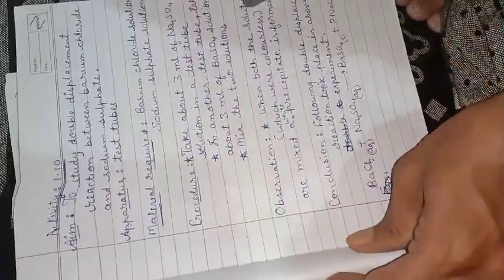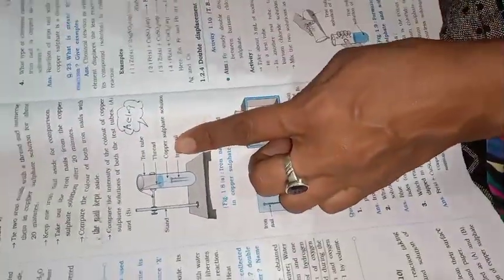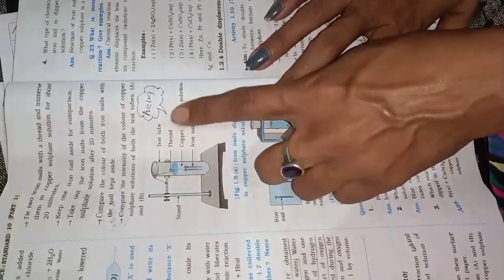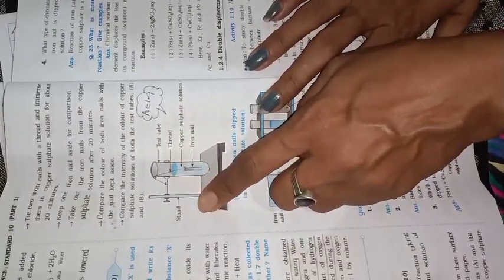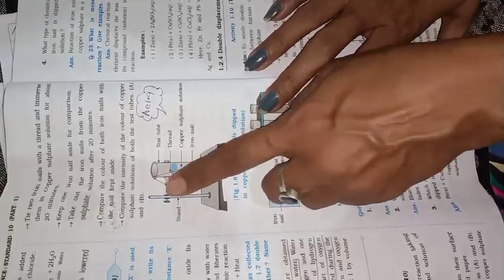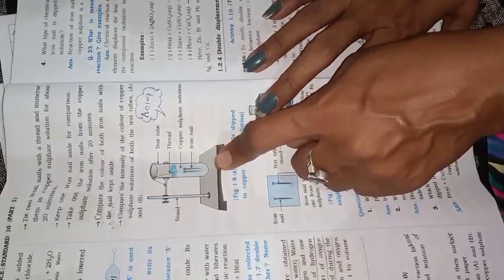Now first let us see the diagram of the figure of activity number 1.9. This is the figure, this is the test tube. We will place the test tube with the help of this stand. Those two iron nails will be immersed with the help of thread. So this is the figure you have to draw along with this activity.